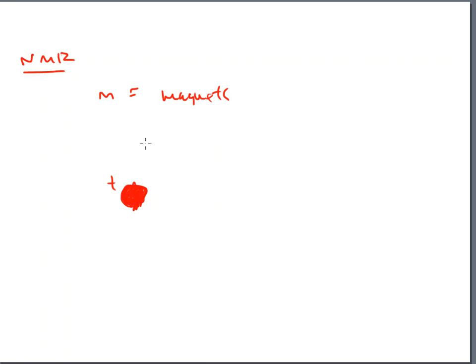You can think of those as little bitty small bar magnets, if that's the way that you want to think of them, with a north pole and a south pole. Oh, North Pole. Have you been a very good boy and girl this year? If not, Santa's not going to bring you anything. So North Pole and South Pole. And what we don't typically understand, because general chemistry doesn't do a very good job explaining it, or really even introducing it at some point, is that these nuclei, they're not just stationary things. It's not just there. There's actually a spin that's associated with them.